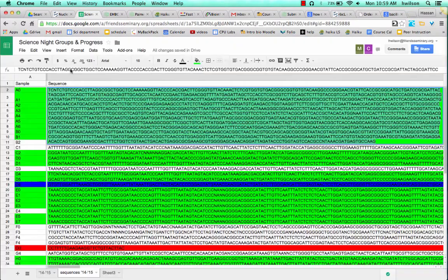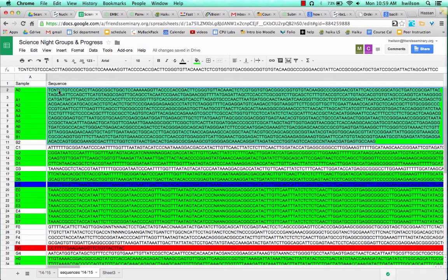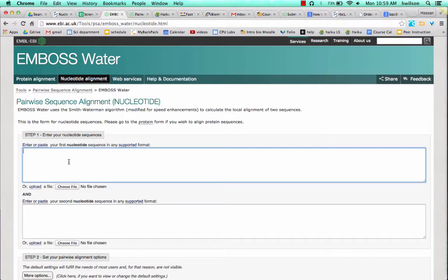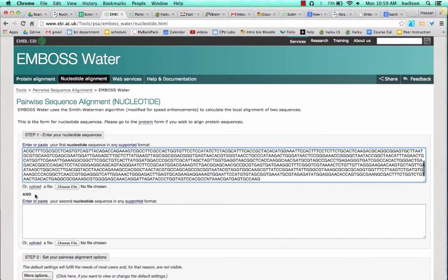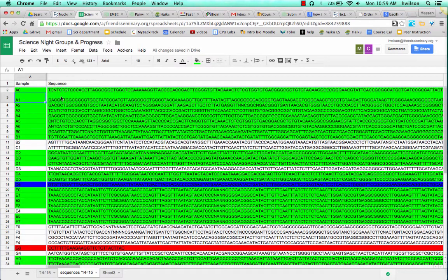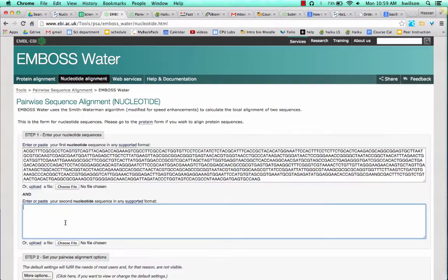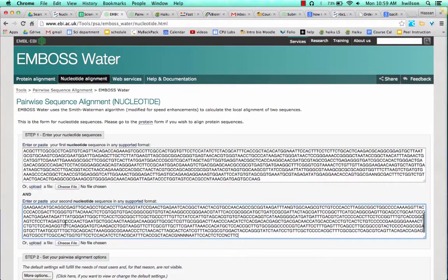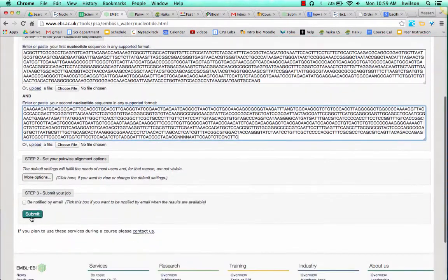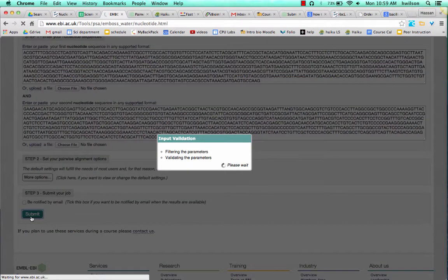We're going to select two sequences. Put in the first sequence there, select the second sequence, paste and then click Submit. Give it time to run.